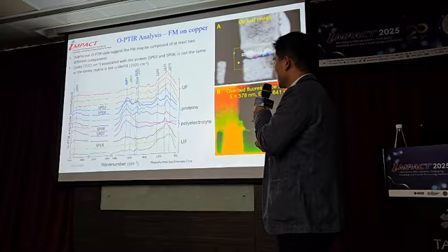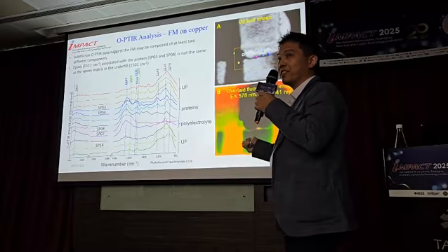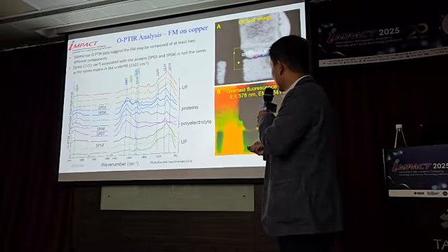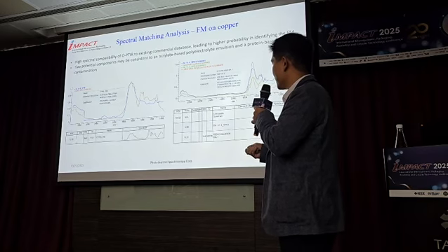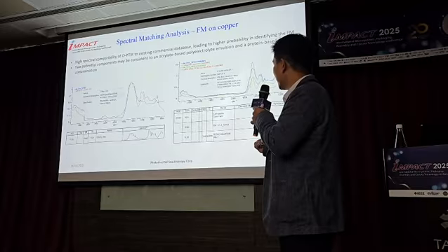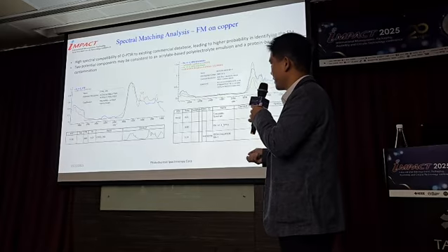exactly. Based on these absorption bands, we know that it's proteins, and it is quite different from the underfill that we see on the side. Now we can plug the data into the database, and we can figure out that this is a protein mixed with another material that is an acrylate emulsion.